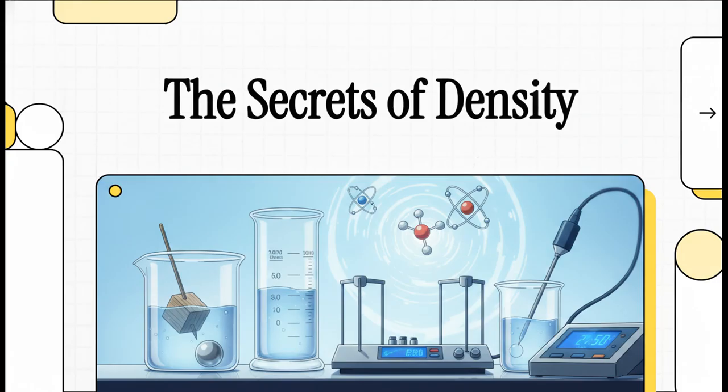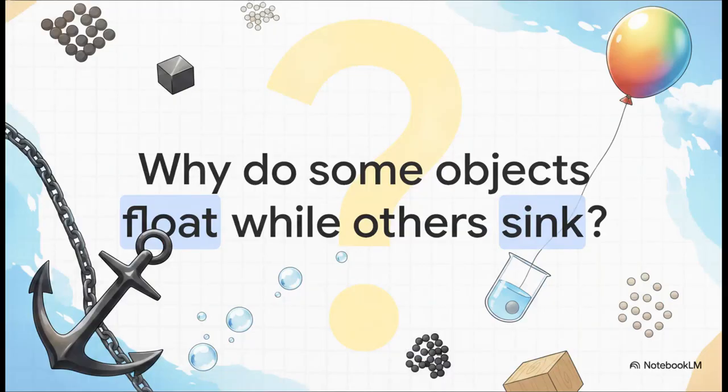Just take a look around at all this. We're surrounded by precision balances, high-tech digital sensors, and beautifully illuminated glassware. And we're setting up all this equipment today to immerse ourselves in a fundamental property that literally dictates the architecture of our entire physical world. We're talking about density. It's kind of the ultimate captivating mystery, right?